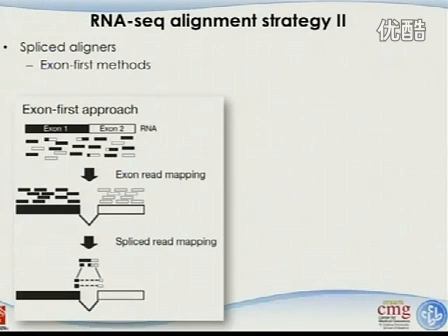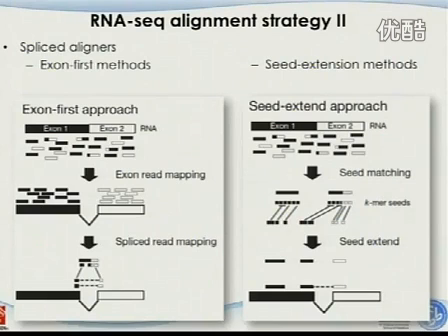And the next stage is you further work on the remaining reads. The way to do that is people separate those unmapped reads into smaller chunks, and then individually map each one and then connect them further. So some people are doing that.